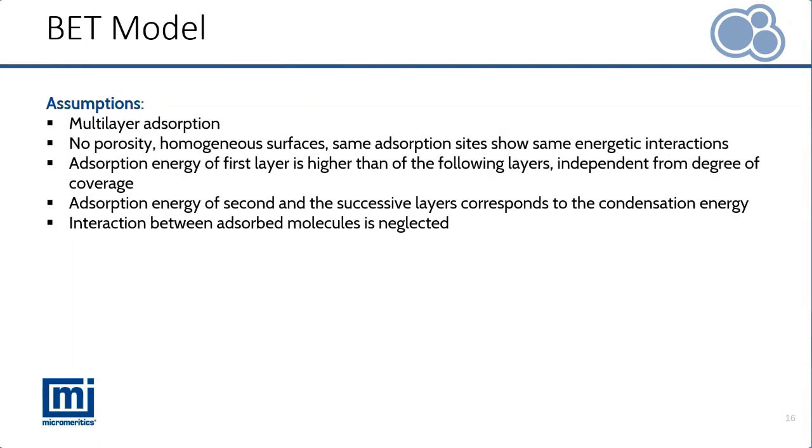Beside the multilayer adsorption, Brunauer, Emmett, and Teller consider the materials under investigation to show no porosity and to be homogeneous. That means there are no different sites. All adsorption sites show the same interaction energy. Two slides back, I already explained that we now know this is not true.